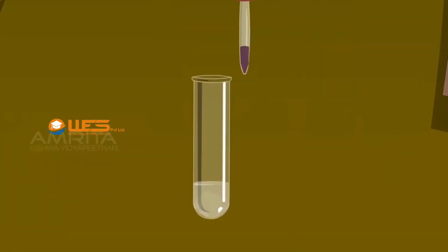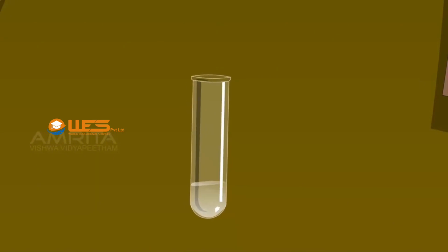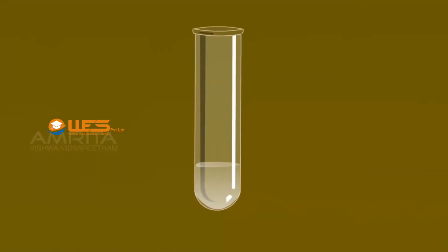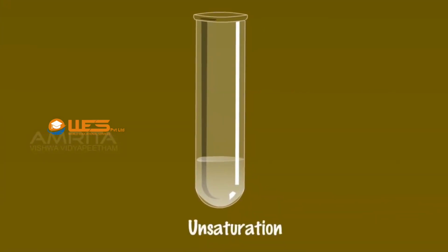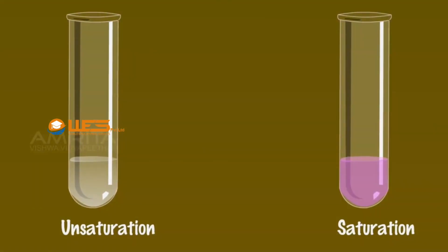Now, add 2 to 3 drops of KMnO4 solution to it. Decolorization of pink color of KMnO4 indicates unsaturation, otherwise it is saturation.